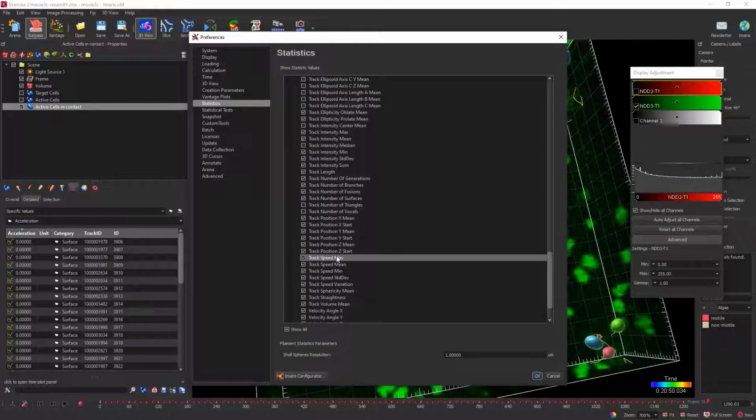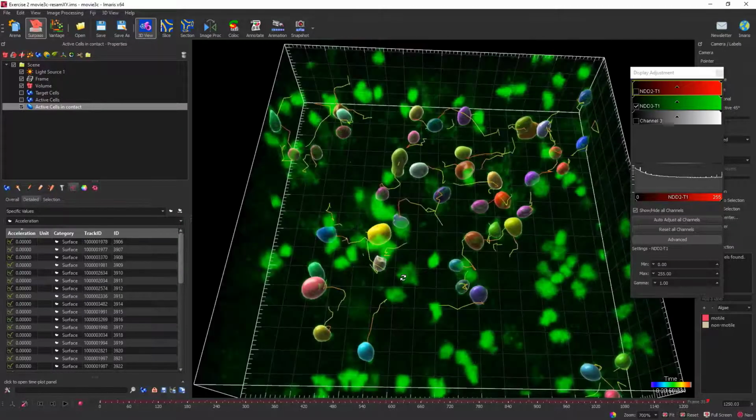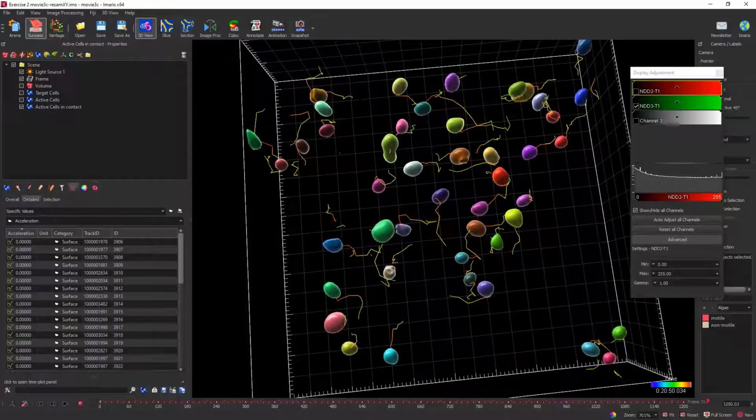Yep, exactly. Way to cover multiple questions at once. Thanks, because we did have that one. Okay, I think just one last thing pretty quickly at the end. We had some questions about just the coloring of objects versus tracks, and I just want to make sure that we've made that clear for everyone, how that's controlled and what your options are for the coloring.